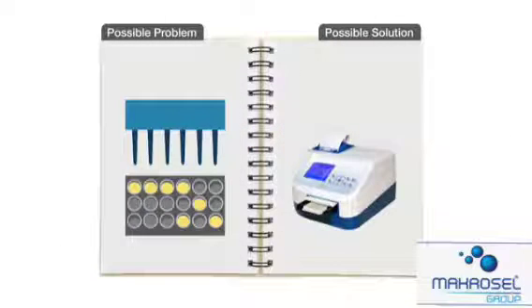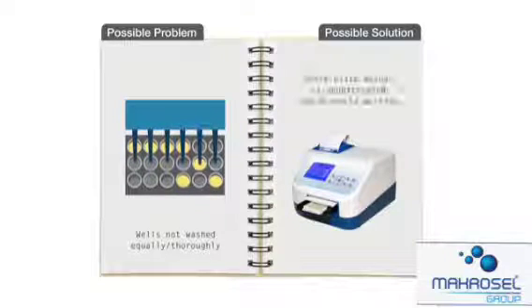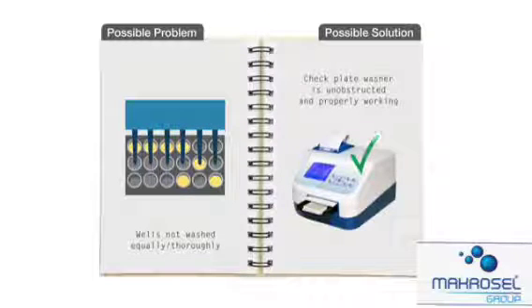Also, wells that are not evenly washed may lead to a high variation between wells. If using a plate washer, please check to confirm it is working properly and pipette tips are not obstructed.